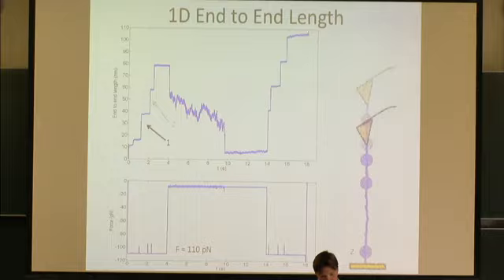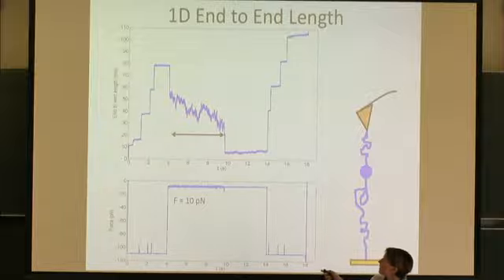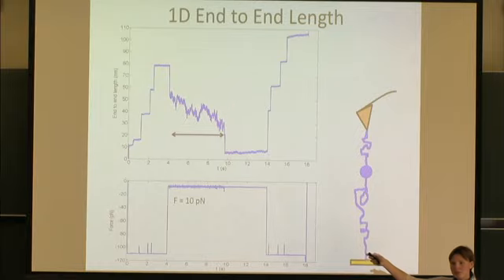So this part you know, and this is the part where you let go. See here I let one of the guys not unfold. This is the guy we didn't observe unfolding. And then here is where they're refolding, and you're still measuring this end-to-end length. And the thing that you should notice is that even though at the end of the experiment you reach the folded length, if you were to pull immediately after the experiment gets here, you'd get no staircases. They still haven't refolded.